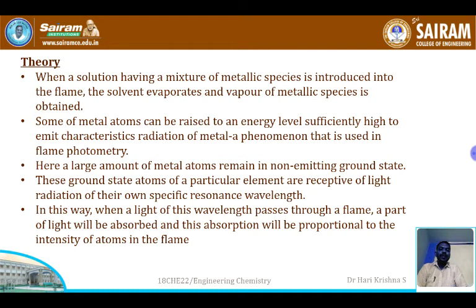Even here we are going to subject the sample to the flame, but we are not worried about the metals which go to the excited state. Even when we subject the sample to the flame, there are some metals which will not go to the excited state. We are concerned about that. We take a solution having a mixture of metal species and introduce it to the flame.